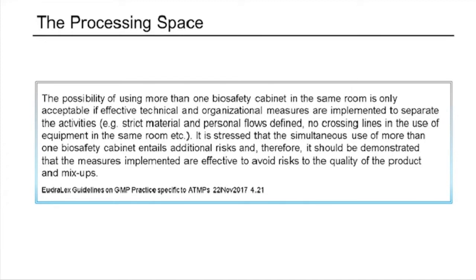It is stressed that the simultaneous use of more than one biosafety cabinet entails additional risks, and therefore it should be demonstrated that the measures implemented are effective to avoid risks to the quality of the product and mix-ups. So this outlines that you can perform multi-product production in the same room using open operations within biosafety cabinets, but heavy emphasis on procedures in place to prevent, quote, mix-ups.